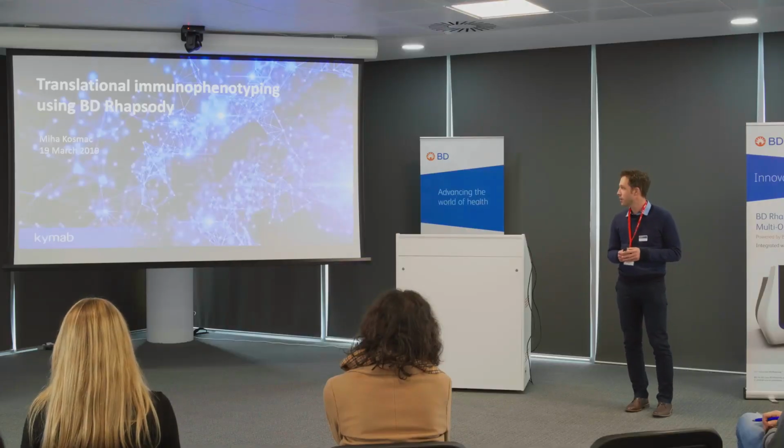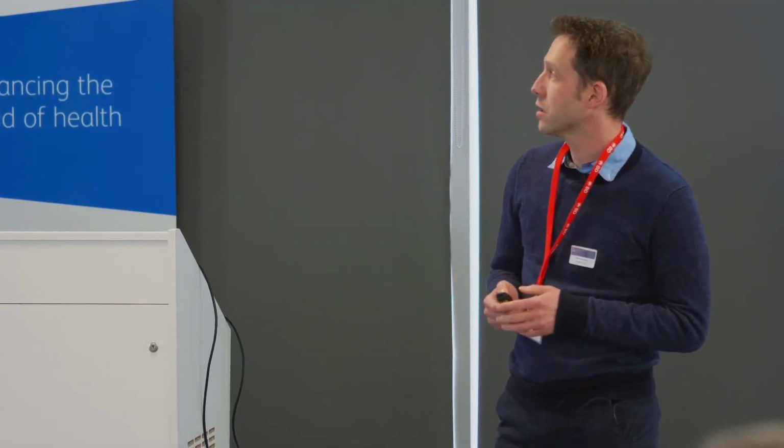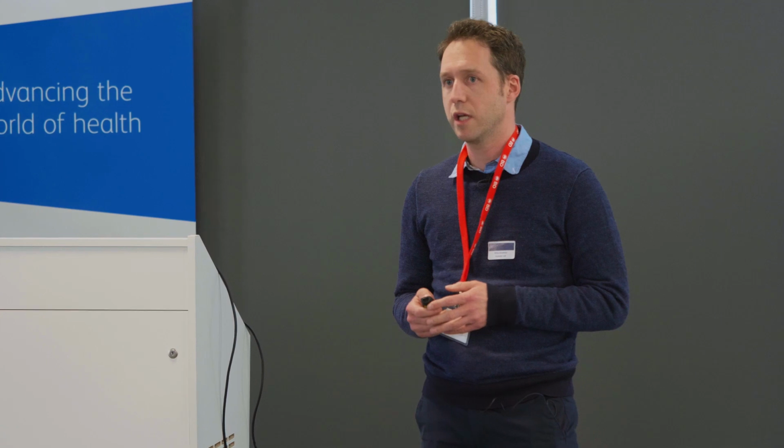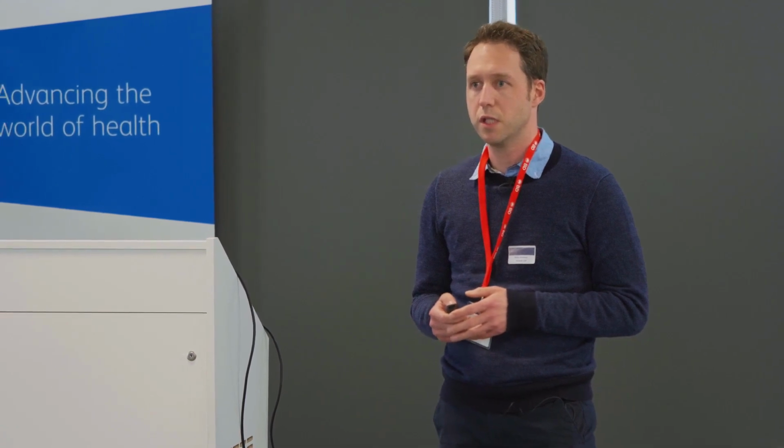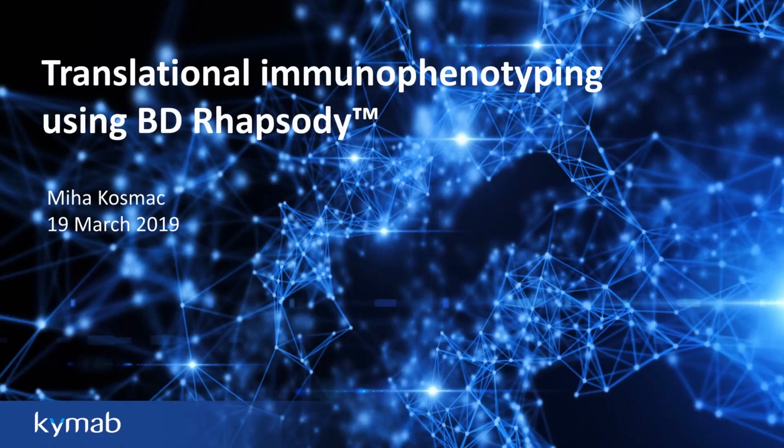My name is Miha. I work for a Cambridge-based biotech company called Kymab. What I wanted to talk to you about today is how we're using the BD Rhapsody platform in our translational immunophenotyping. We did single-cell RNA sequencing using the BD Rhapsody platform, and I'm going to tell you a bit more about that. And then we also did bulk RNA profiling using the NanoString.